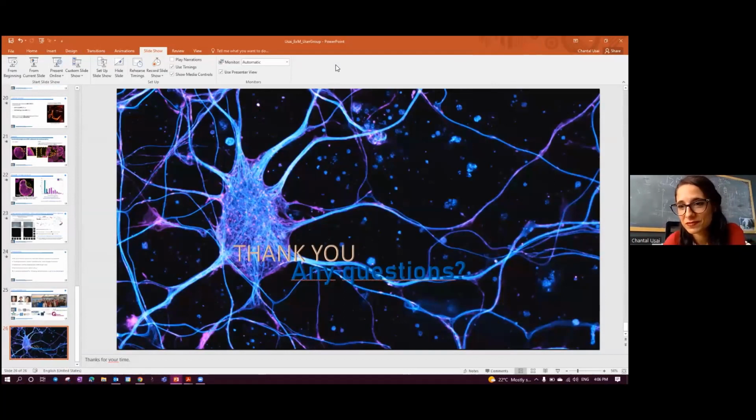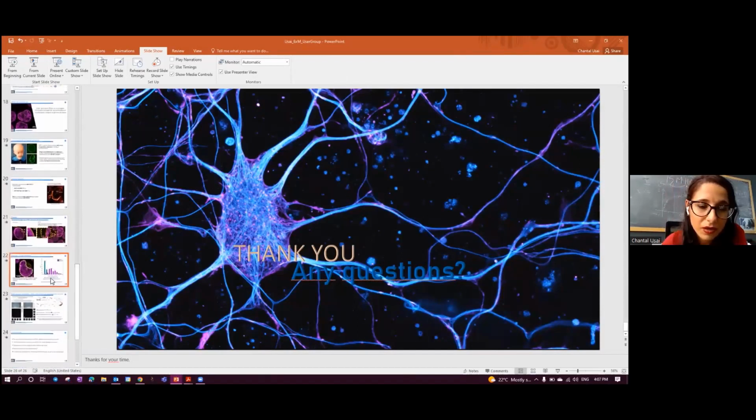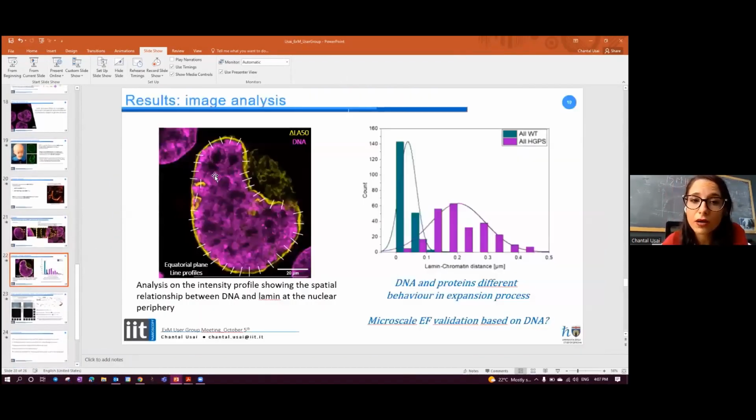I think Mattia has a question. You can unmute yourself. Hi, thanks for your presentation. I have a biological question about the experiment that you're trying to do with the DNA. Why didn't you use a heterochromatic mark in your experiment? Maybe a mark for a lysine modification that you can tag, and you just get the heterochromatin?